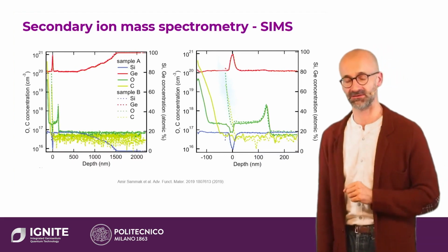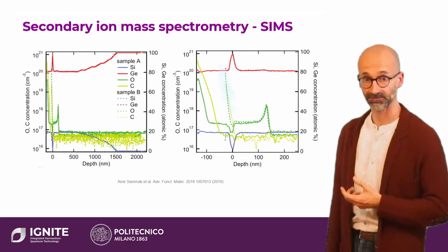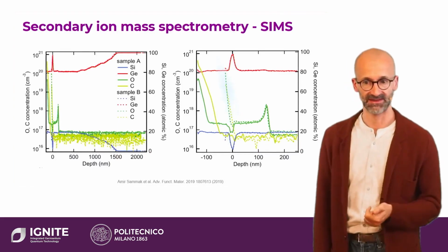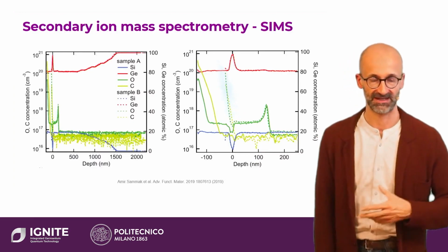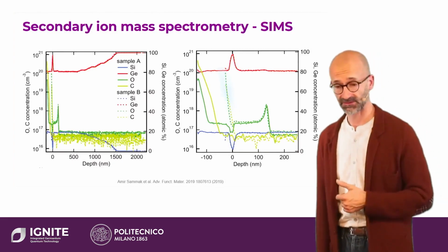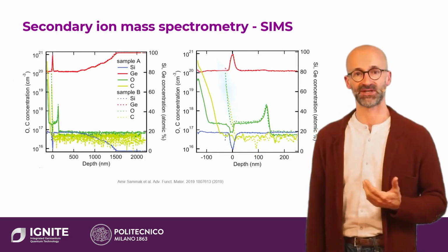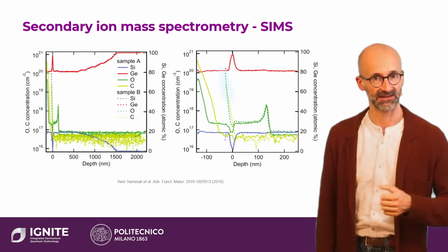And you can see the silicon and germanium compositions varying with depth. And you can identify where the quantum well is because you can see the peak in the germanium and the dip in the silicon. Associated with this, you will also see, for example, boron. It's natural that boron would be a contaminant in a system that's been used for p-type doping, and also boron tends to accumulate on the surface of wafers which are left in a laboratory. Maybe more critical is also the background of oxygen. And the background of oxygen, which is a major issue which needs to be identified and solved, tends to accumulate more in the silicon germanium than the pure germanium channel itself, but may cause a kind of neutral impurity scattering which is limiting the performance of qubits.